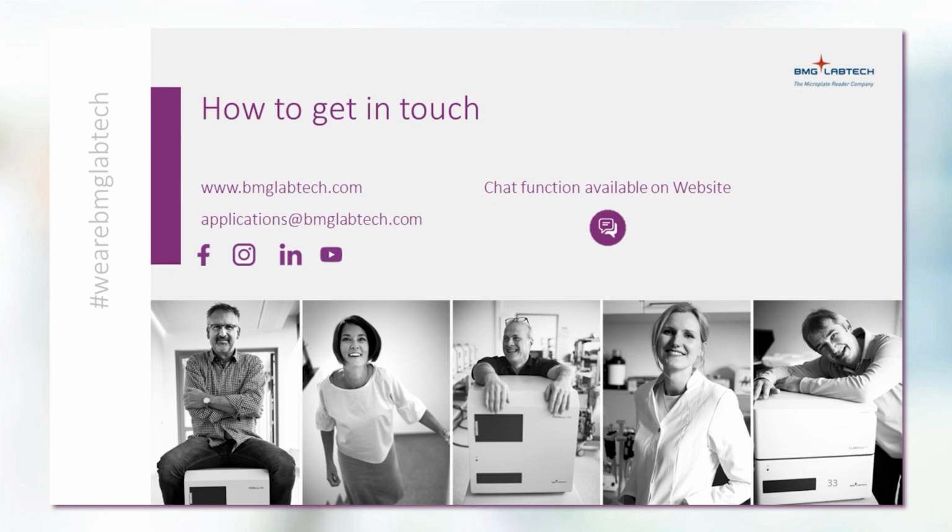Well, there's no general answer to this question, since the settings and also the ideal plate format and everything that can be set in the control software strongly depends on the sample that is used. So if you need some more details and are happy to share the details of your planned assay with us, please just contact us, and we're more than happy to go through it with you in more detail and give you advice.